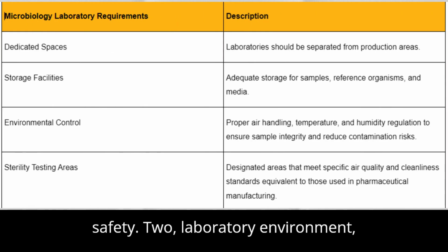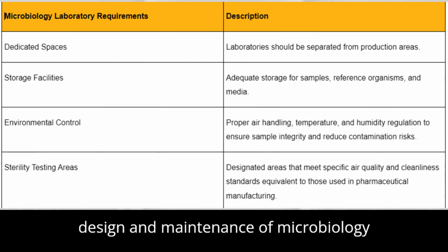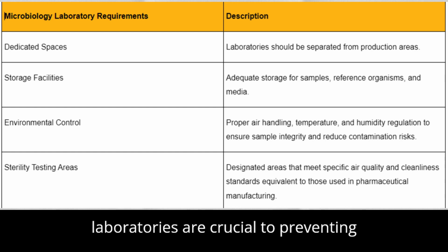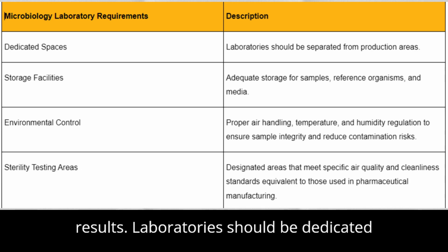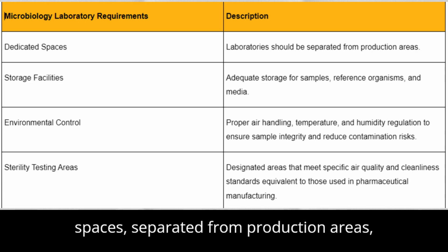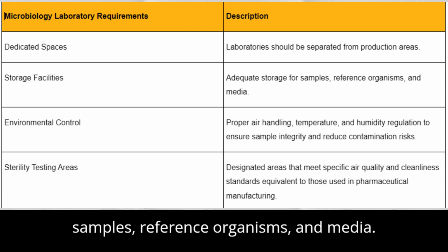2. Laboratory environment, ensuring contamination-free zones. The design and maintenance of microbiology laboratories are crucial to preventing contamination and ensuring accurate results. Laboratories should be dedicated spaces, separated from production areas, and equipped with adequate storage for samples, reference organisms, and media.